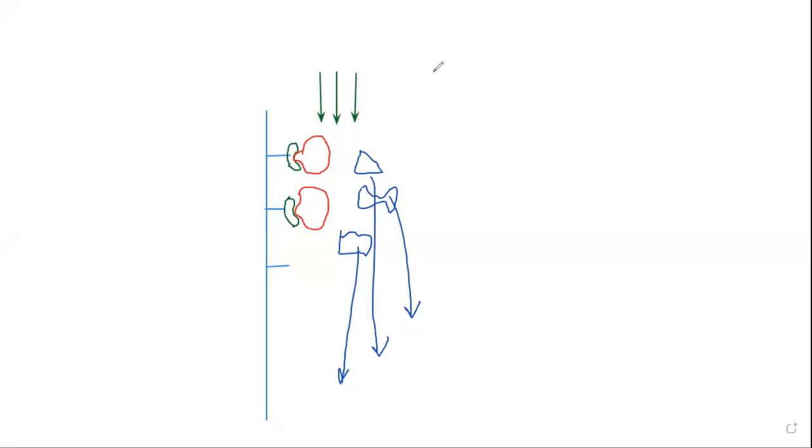Okay. So what we now do is we have this same molecule, the green colored molecule, which is already attached to the chromatographic medium. Okay. This attachment is by covalent interaction. I'll just try to write that here.